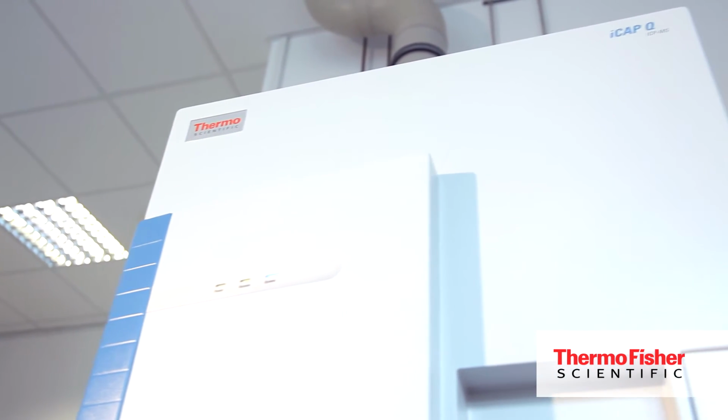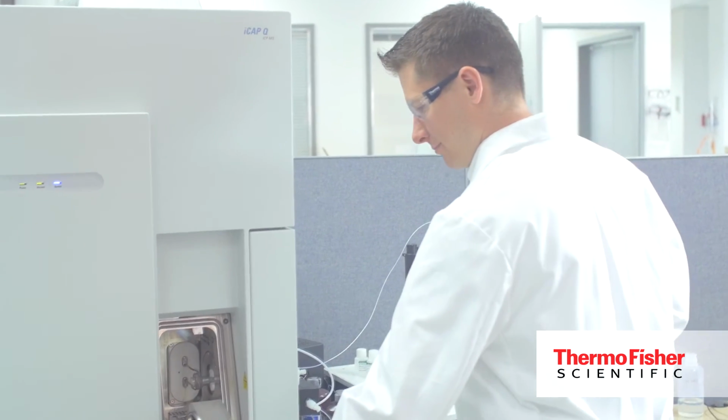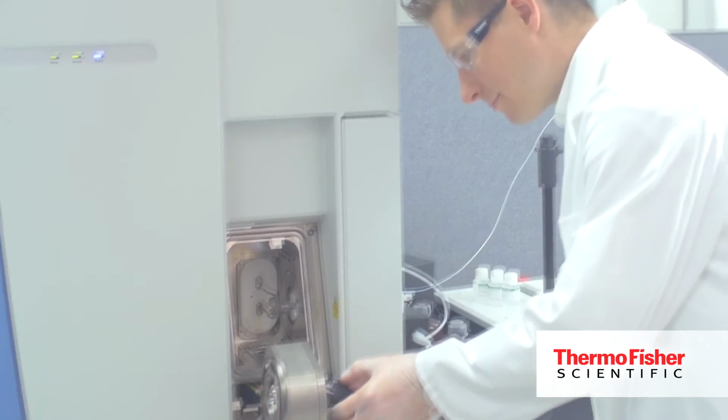The major market for the iCAP Q ICP-MS is the environmental market. In the environmental market in particular, the productivity is key. These customers want to analyze thousands of samples per week. What we've done is we've integrated quality assurance and quality control systems into the iCAP Q ICP-MS to enable them to do that in a more automated fashion. So the quality control is essentially doing the analysis job for them. It's picking up over-range samples, and we also have the integrated auto-dilution.